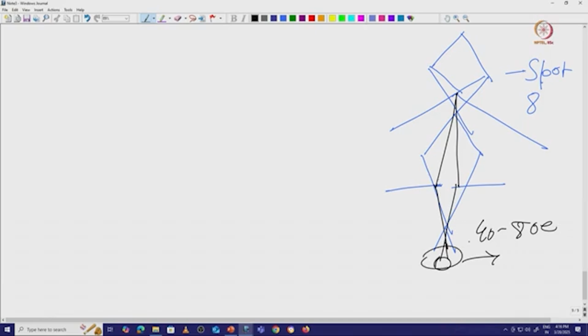But one more thing you have to keep in mind, that I discussed last class. If there is a sample and electron beams are going, we really don't want the electron beam to fall on our sample like this. It should always be parallel.